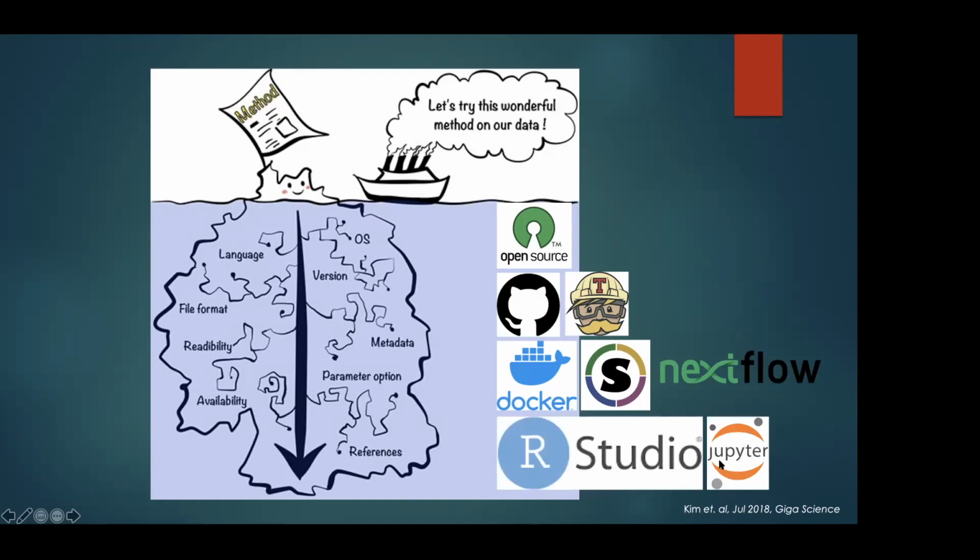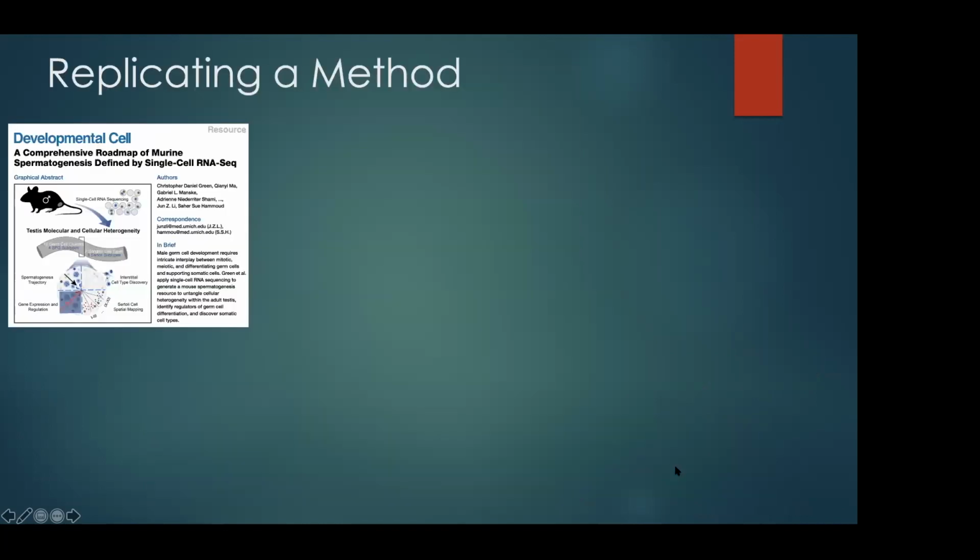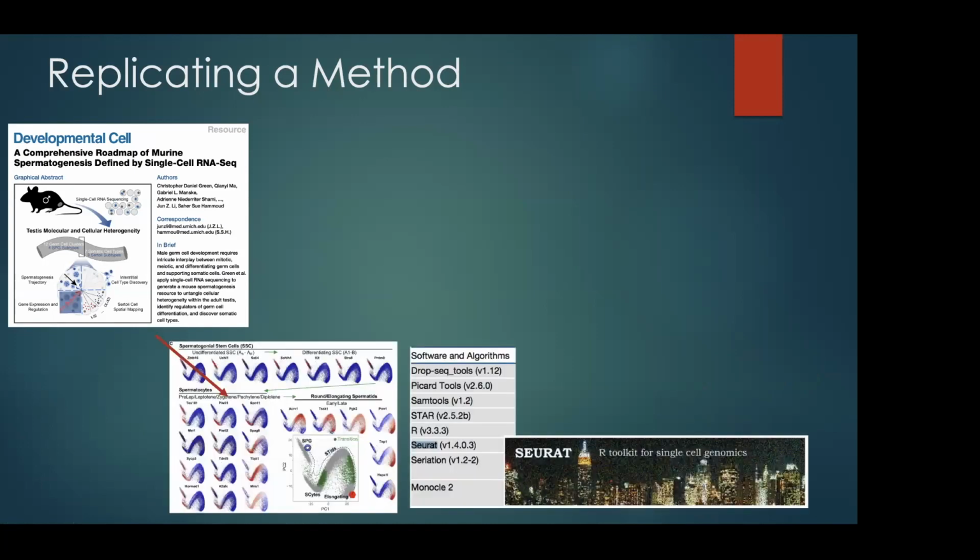These help us a lot because science improves every day. Once you process data, you can always improve how you analyze your data with new algorithms and new methods, and share these analysis results, again, in your repository on GitHub or in Jupyter notebooks. So here I just want to give an example: I wanted to reproduce this paper, which was published a couple of years ago. It's not that old, 2016 or something like that.